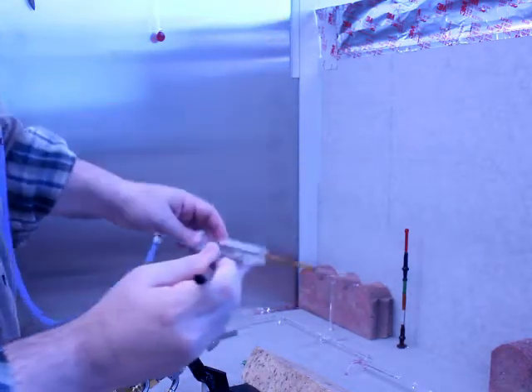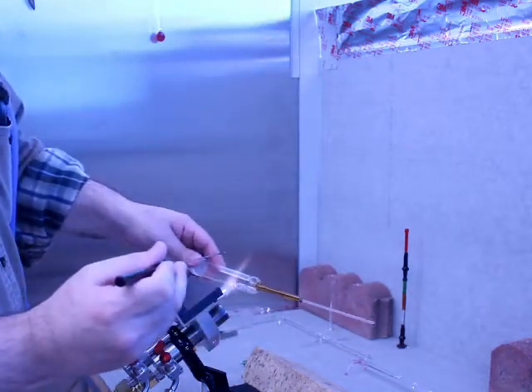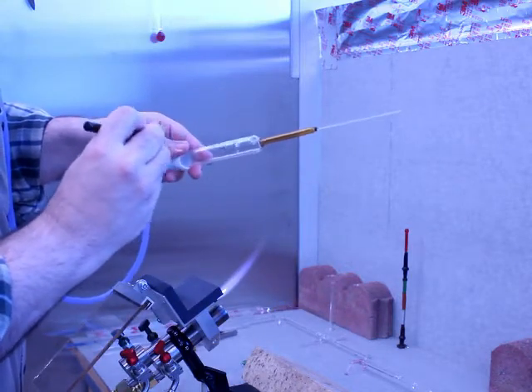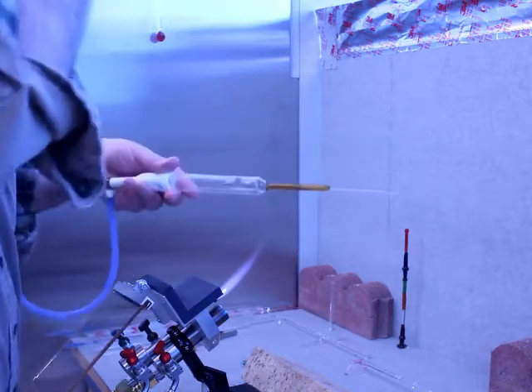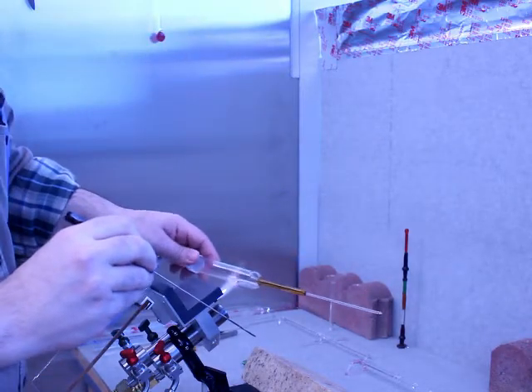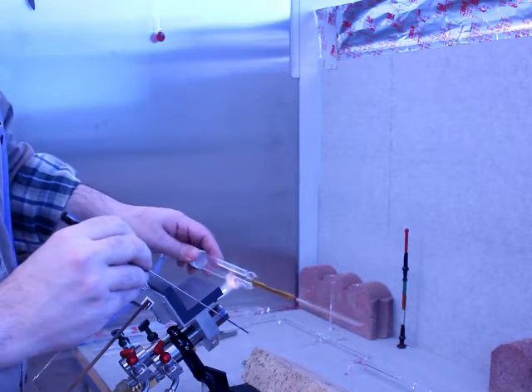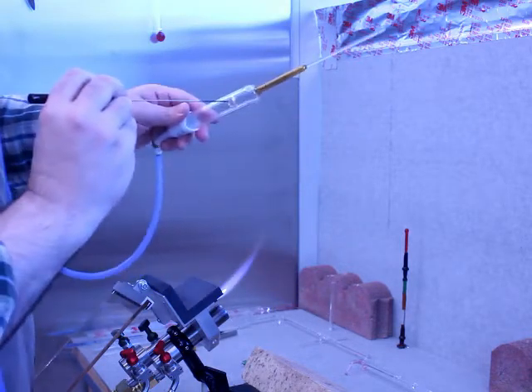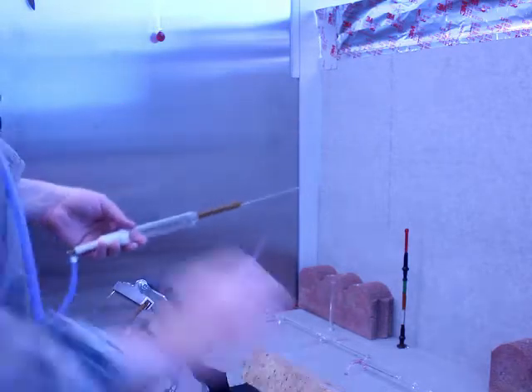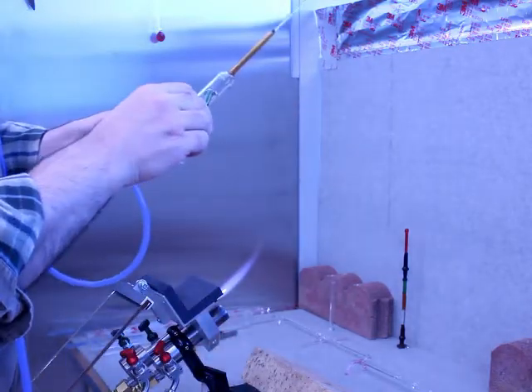As I remount this hole, the idea is to actually lift the glass up, forming a lip, because if I let the glass fold down into the tube, it becomes a mess at that point. And that's something, again, I need to work on quite a bit.